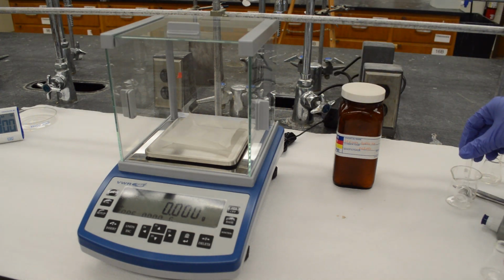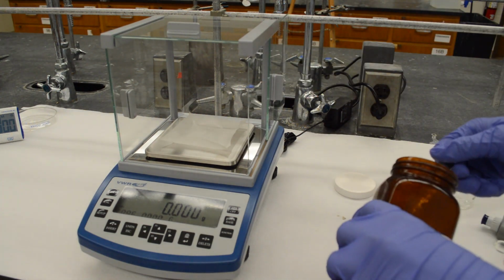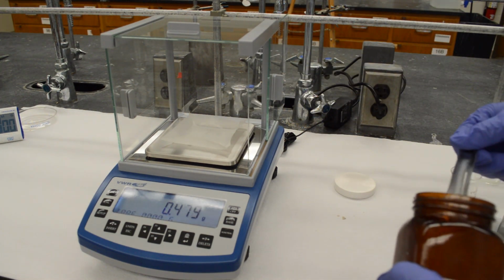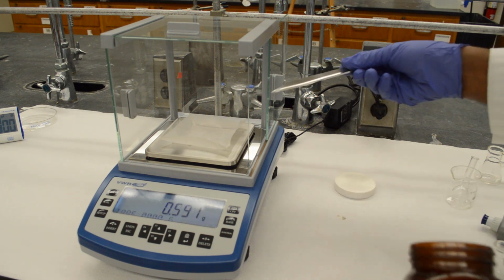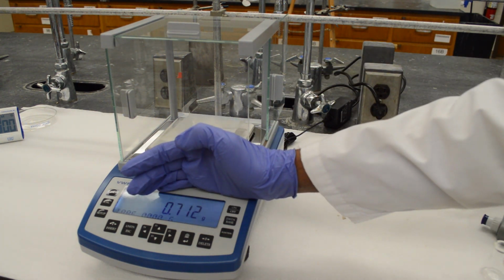So I'm going to use that weight. Probably one more pellet. Note down the weight of sodium hydroxide.